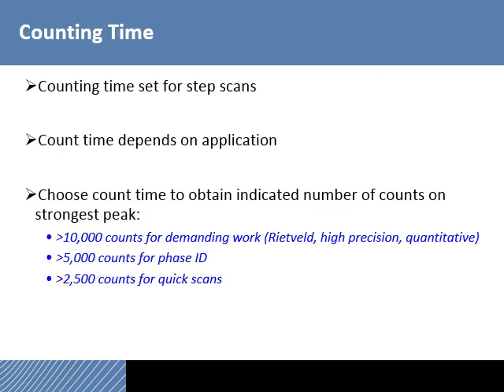The counting time is an important aspect to obtaining a good diffraction pattern. Simply put, the longer you run your scans for, the better your pattern will be, but obviously there becomes a point at which scans can become ridiculously long. Most people are in a hurry. So probably the best way to think about it is that the count time depends on the application that you're trying to do.